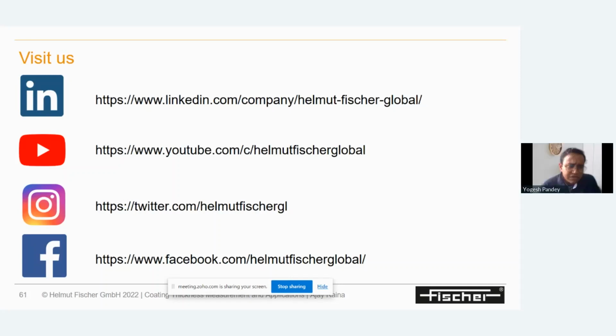We can measure the intermetallic layer up to 24 layers. I think we can measure the coating without destroying it, up to 24 layers. We can measure whether it is an intermediate layer, top layer, or bottom layer, depending on the densities of the material. But the customer has to give much more insight, like they have explained some flow process. So basically, we have to go in depth with the discussion after this webinar. We can come back to the customer and get more information from him.